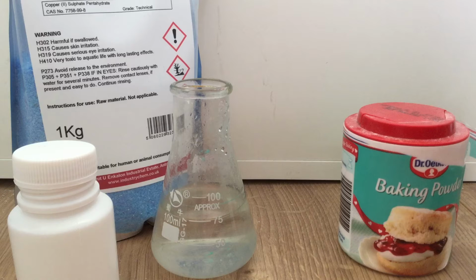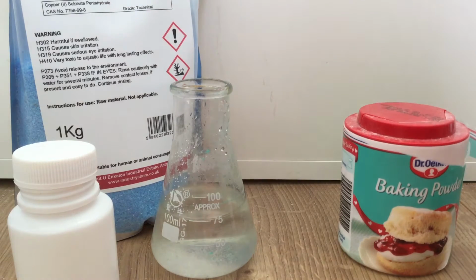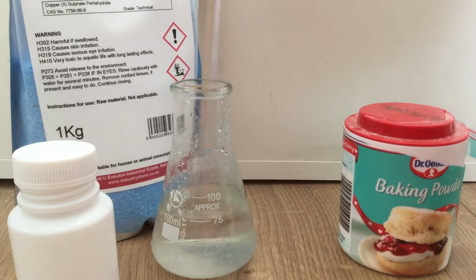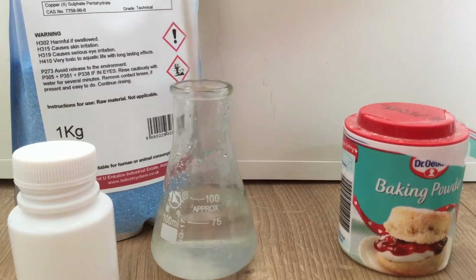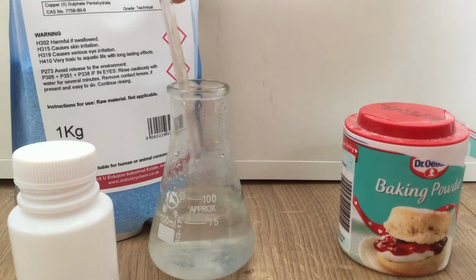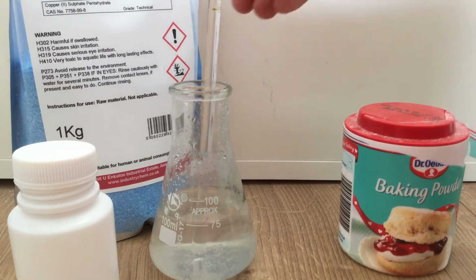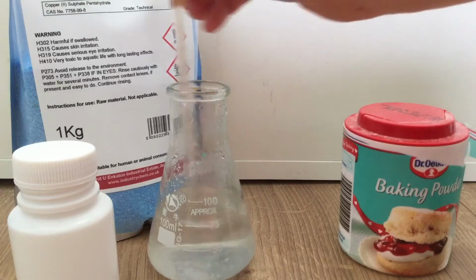What I'm gonna do first is add in some of this tartaric acid. Then I'm going to stir the tartaric acid into the water. This will make it slightly more acidic, but from my experiments I've realised that when I do this, it produces much more of what I'm looking for.